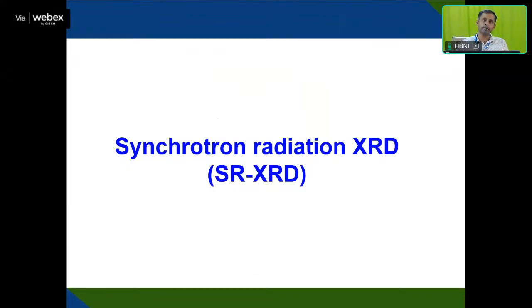From thin film XRD, we mainly get information about the intermetallic structure between two layers, as well as the top layer and bottom layer. Mainly on the thin film substrate, you can then use it to get information about stress or strain built up in the material, and by using depth profiling you can find out the composition or the variation of the elements across the interface.